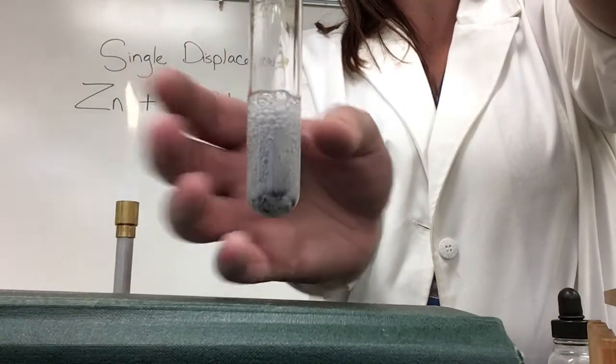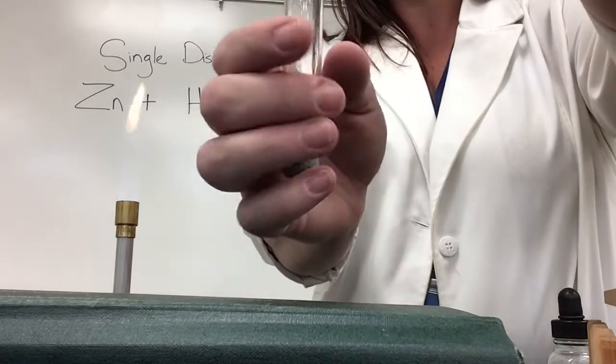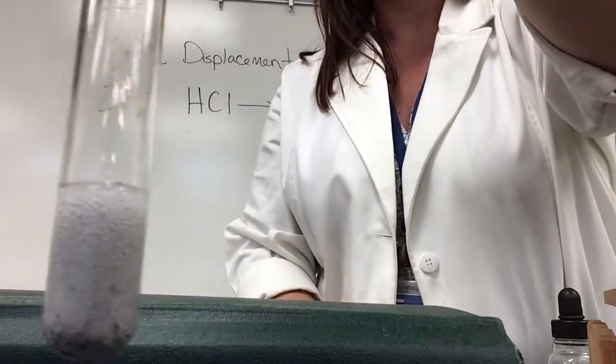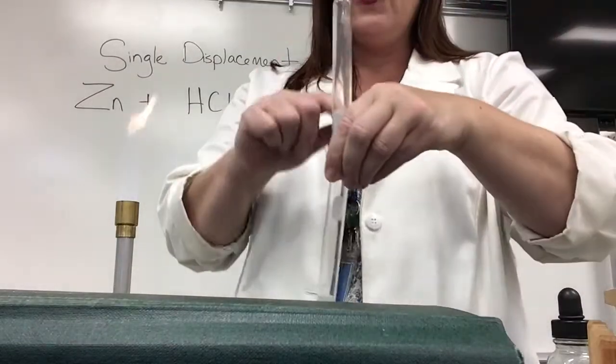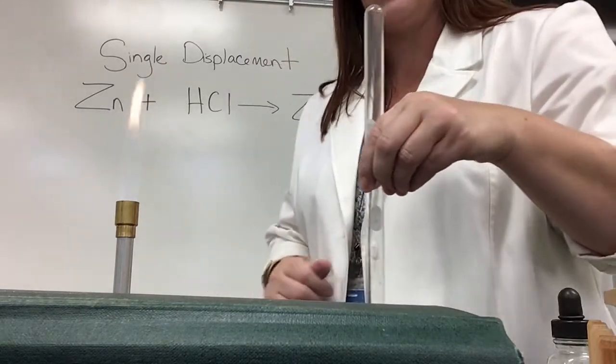It is hot. That is such a strong chemical reaction. It's actually full on, you couldn't hold that tightly with your hands, it would definitely burn you. So I'm collecting a bunch of this gas in my inverted test tube here and while that's collecting, let's talk about the chemical equation.